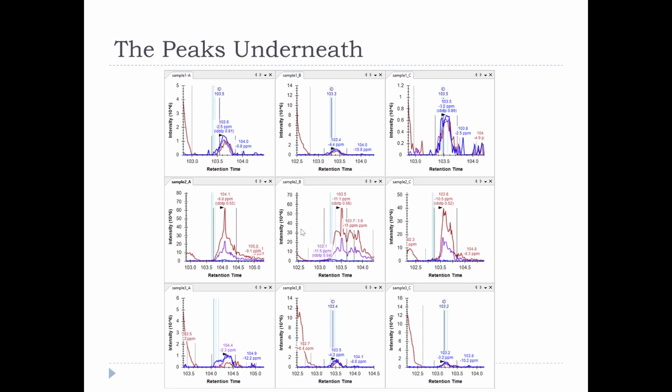Our mass spectrometer has isolated an MS that got ID'd as our peptide in every replicate of sample 1. How about sample 3? Well, I missed one, but how do you feel about this one?